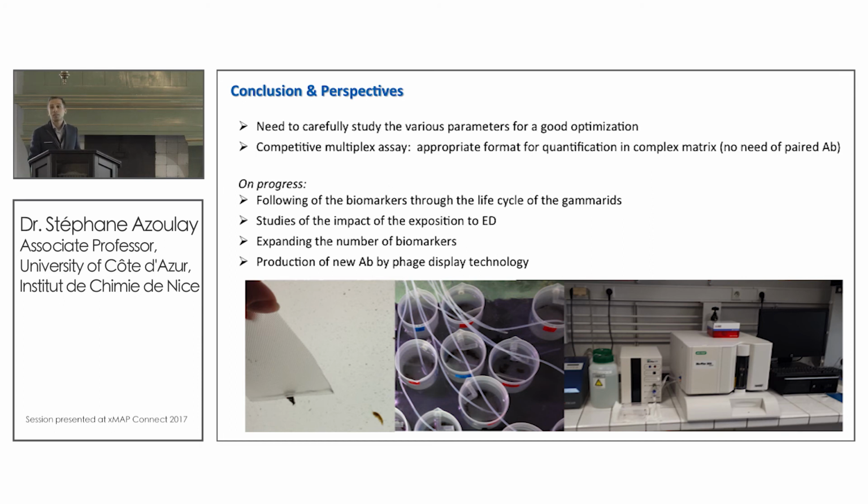Now I can say that in 3 weeks I would be able to do a good assay, but it took more than 1.5 years to do everything. There are a lot of parameters and tips to take into account. A competitive multiplex assay is, at the end, a good format to quantify in complex mixtures. You don't need to have paired antibodies.